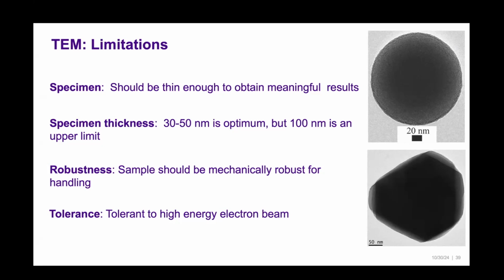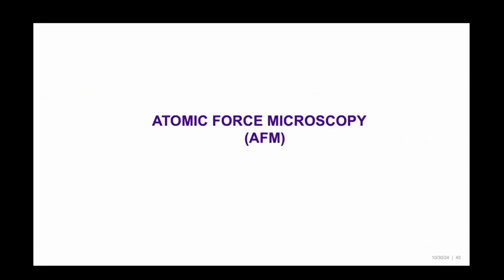If you take the electron microscopy course, on the most advanced electron microscope, there is a dedicated part also about beam damage and many things. I'm also teaching a couple of lectures there. Any questions for TEM? I will have some more details if needed later at the end of this. I think we quickly go through AFM.